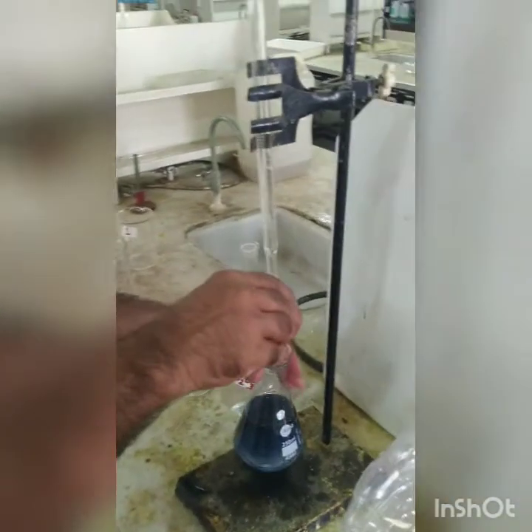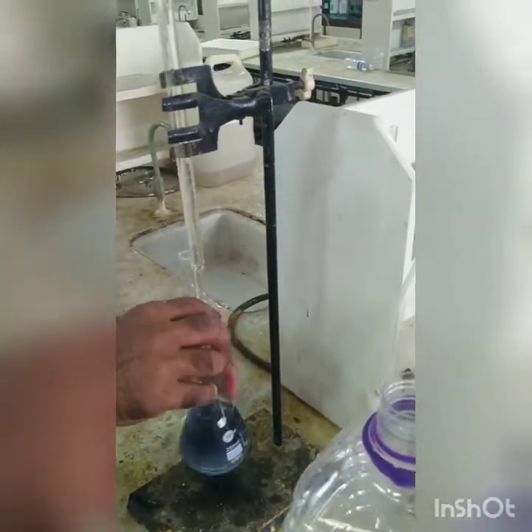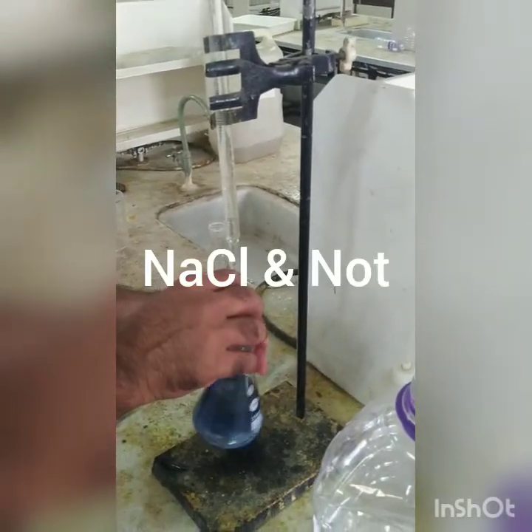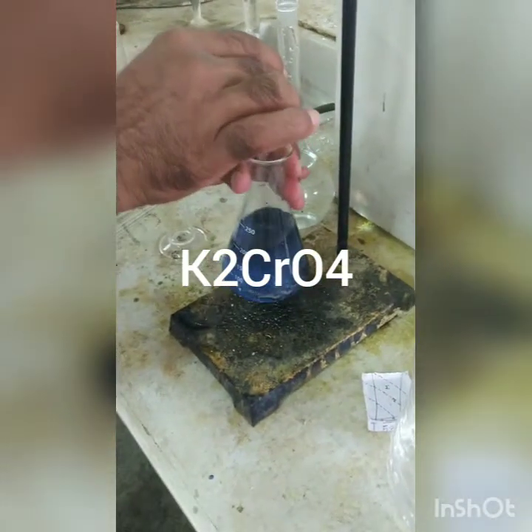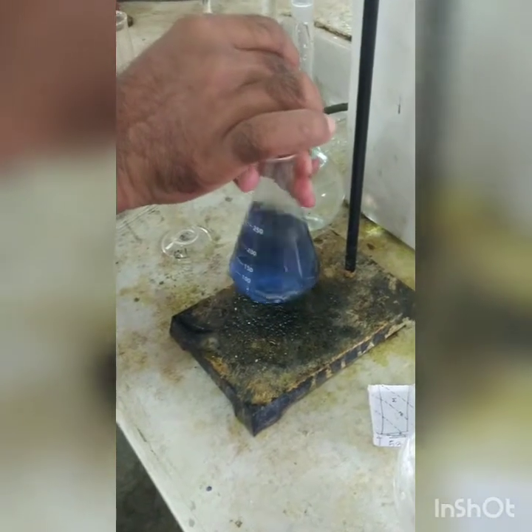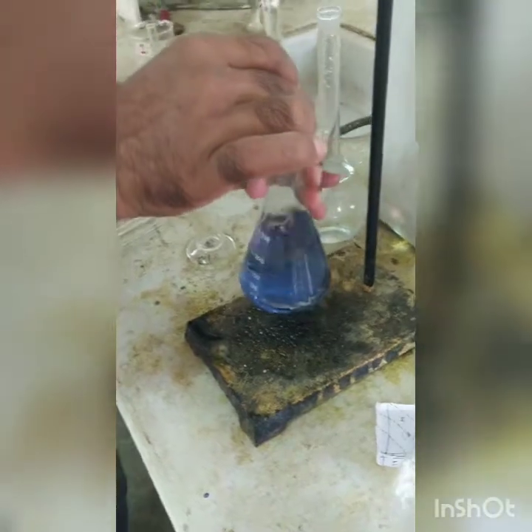Now this sodium thiosulfate we are titrating against potassium dichromate till the disappearance of blue color. So the titration is going on with the addition of more and more ml of sodium thiosulfate.